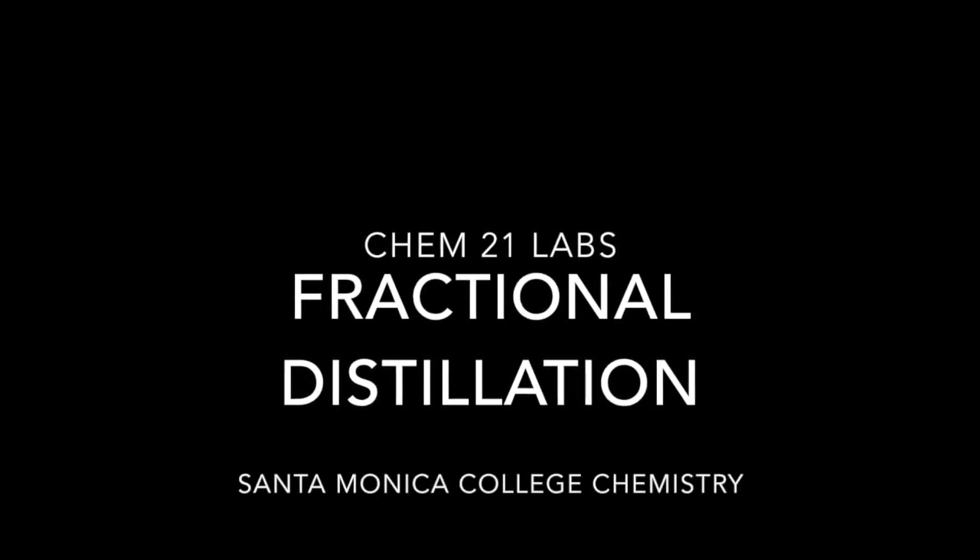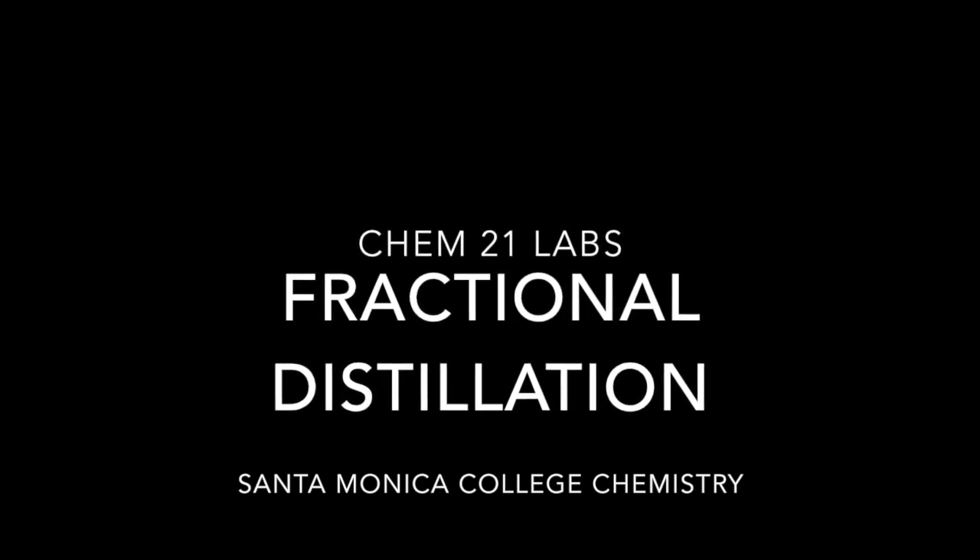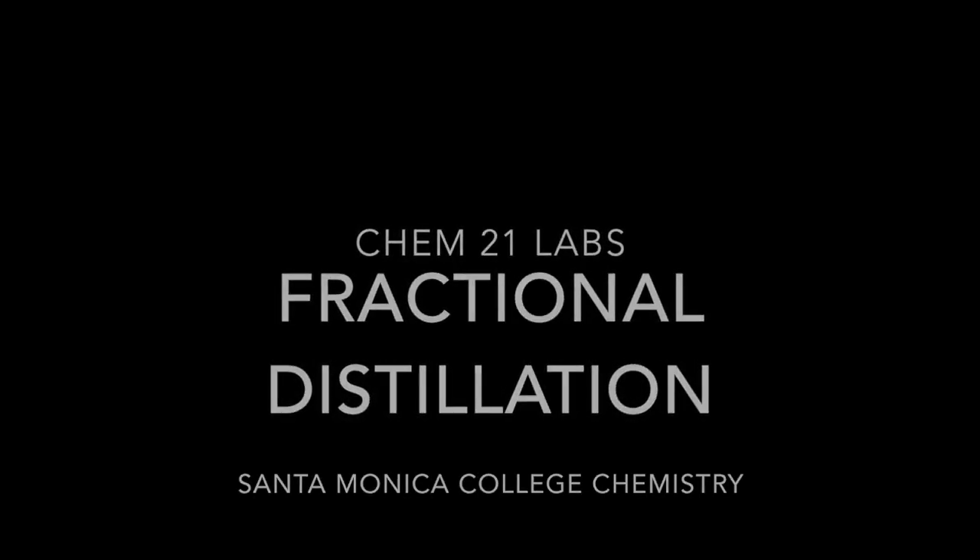Welcome back to CHEM 21 Labs. This is the second part of our ethanol distillation — fractional distillation of ethanol.